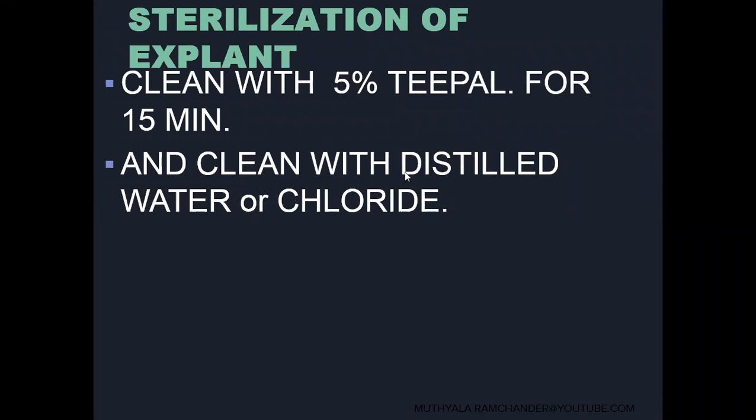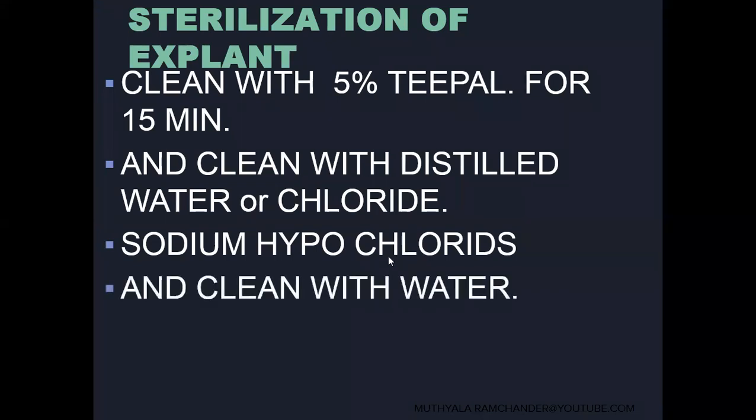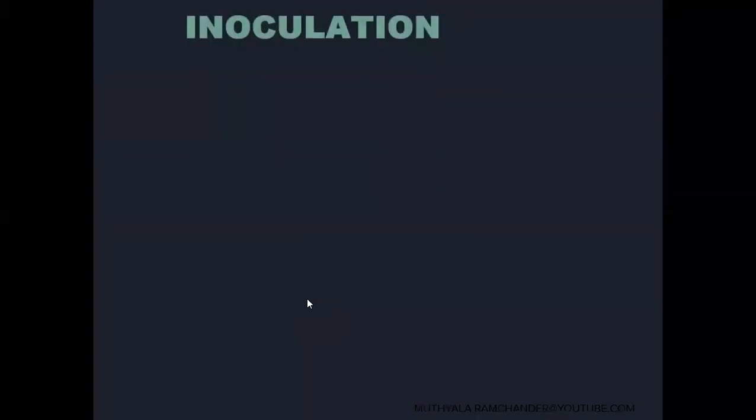Finally, we use sodium hypochlorite solution for the sterilization of the explant, and finally clean with water. Finally, the explant is sterilized.